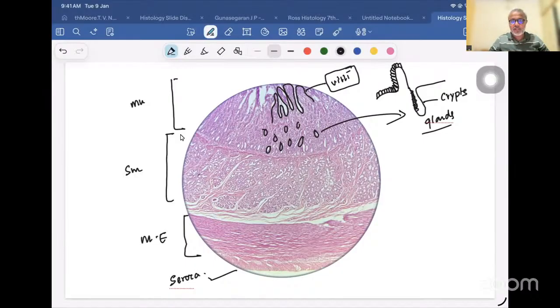You have ground level, and on top of that you have a mountain, that is a villus. Now, if we go deep below the ground level, let's imagine a well. A well is an example for an intestinal gland. Are we clear?